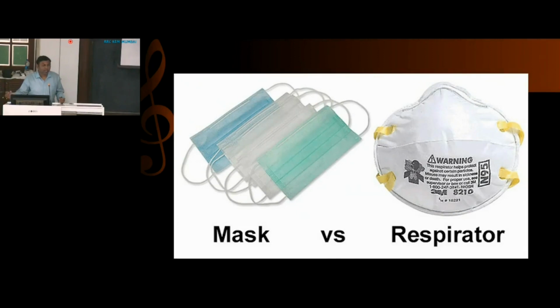But wherever aerosol generation is expected, like a bronchoscopy room, like emergency services where anytime intubation can be done, can you afford wearing a cloth mask or surgical mask? No. This is the only emphasis I want. There you have to wear an N95. If you are wearing an N95 in a classroom, it's good.